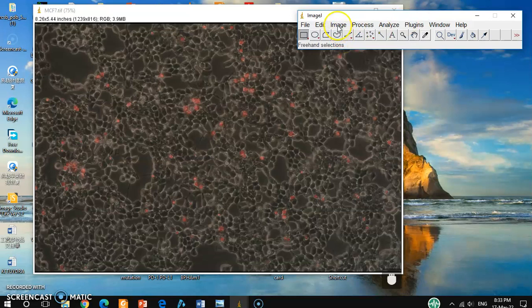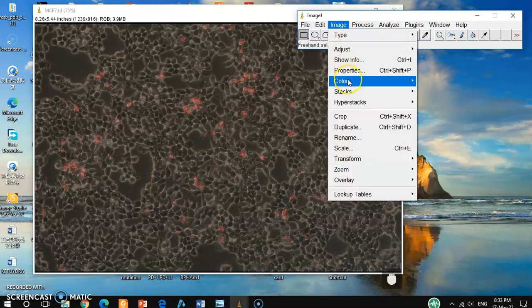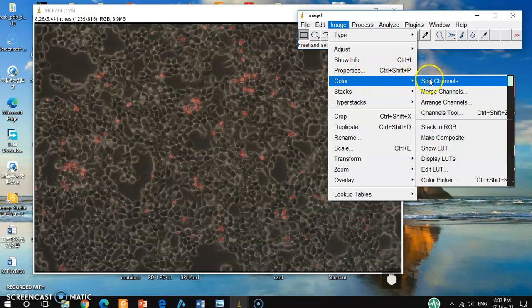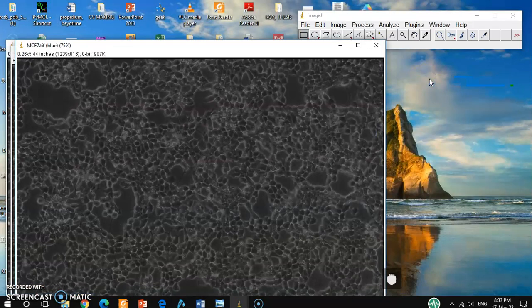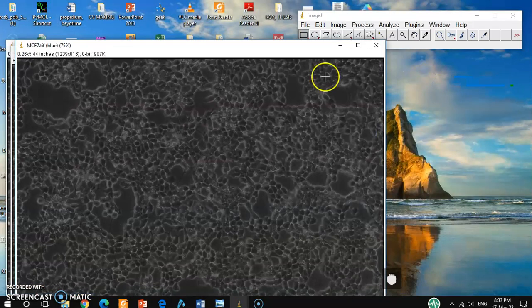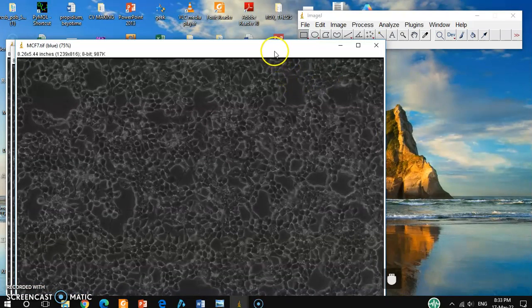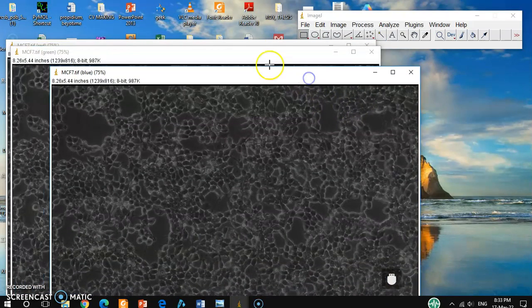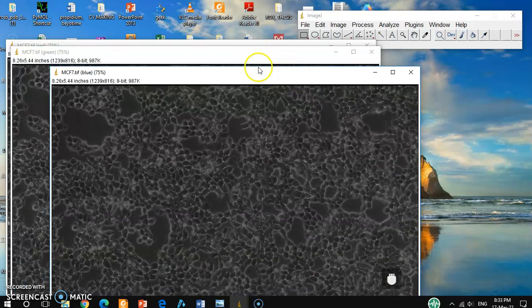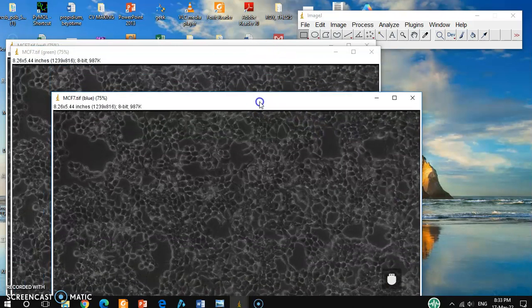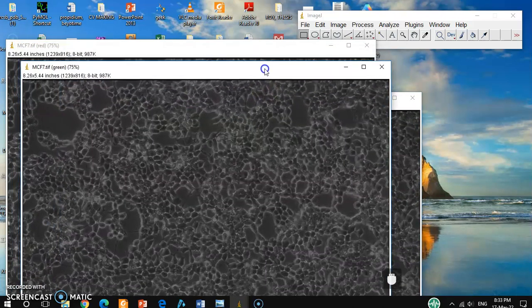For that, you have to go to Image and then Color, Split Channels. Okay.